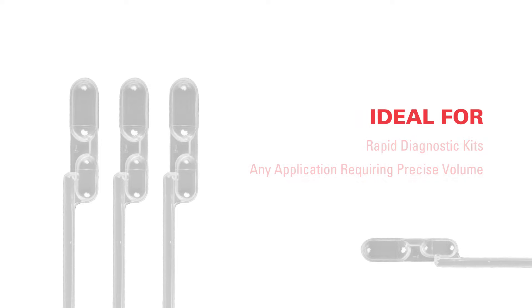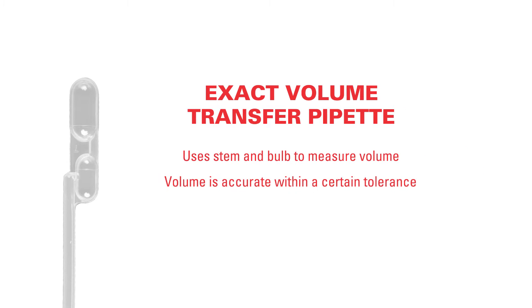Samco exact volume transfer pipettes are ideal for rapid diagnostic kits or any application that requires a precise volume. Exact volume is the name of the transfer pipette and the volume is accurate, but within a tolerance.